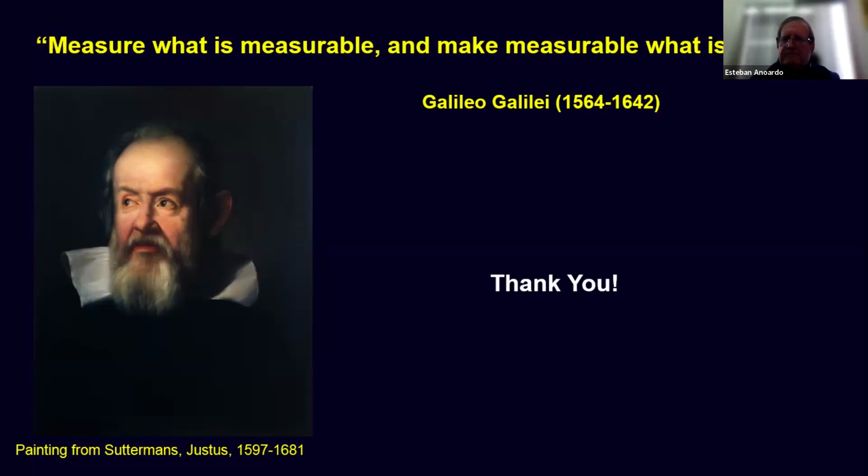The machine. Because we had this morning discussion on this, and we understood that it's very important to have a kind of calibration of the experiment in advance. This is a trouble we have seen quite often happen, but just because the user is not setting properly the parameter.